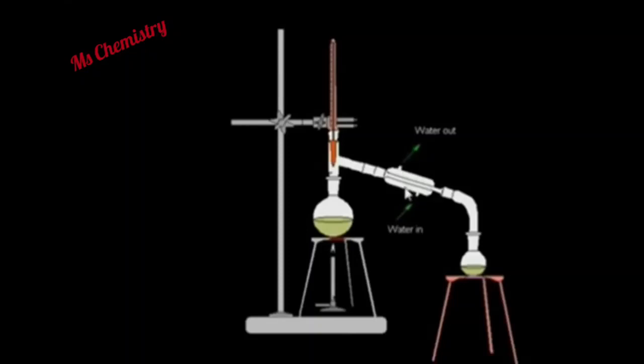Also note down that the water inlet is from the lower side of this condenser. And what is the purpose of this water inlet? That the condenser should be filled with the cooled water all the time during the whole experiment. This condenser should be filled with this cooled water. Okay, I hope you all are getting what I want to say.